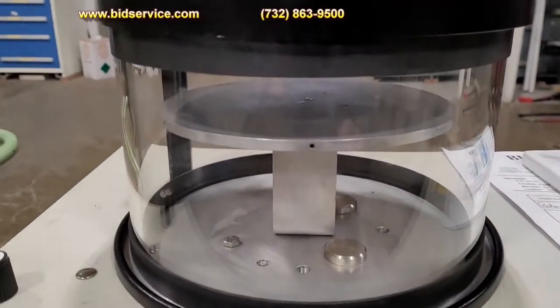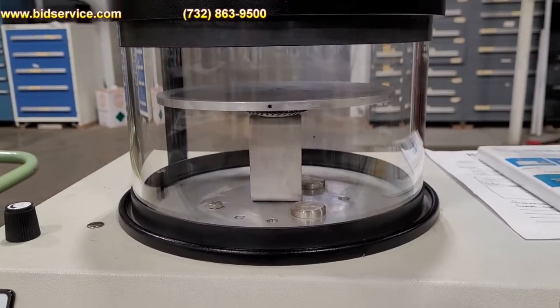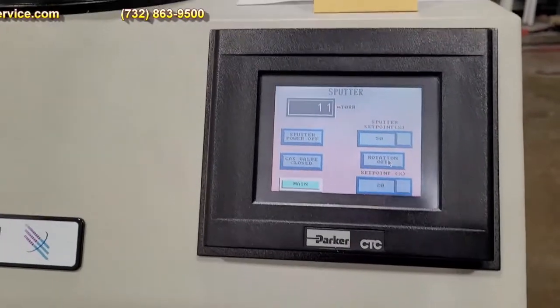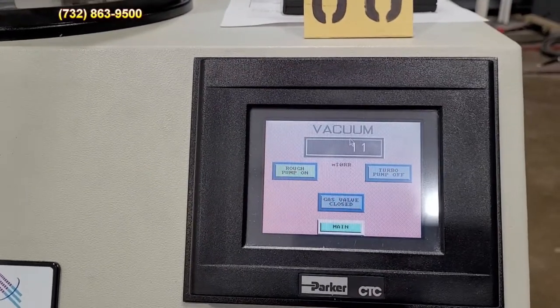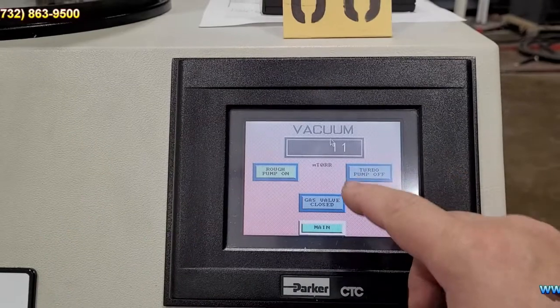Here is your chamber. It does have a rotary platen in there, and here's your main control screen. Basically, you would turn on the vacuum and turn on the roughing pump to turn on the pump, and just wait for it to pump down.